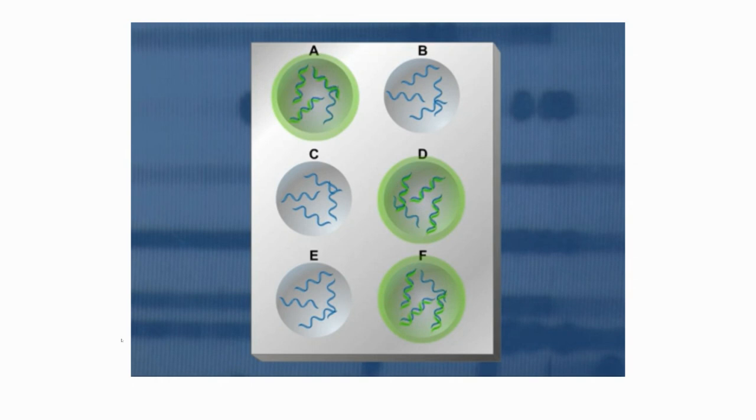In an actual microarray analysis, a typical cell would express hundreds or thousands of different mRNAs, so that hundreds or thousands of different spots would be identified. Therefore, microarray analysis is a powerful method to study the expression of many genes simultaneously from a particular type of cell or from cells that are exposed to a specific environmental condition. Okay, that's the microarray.